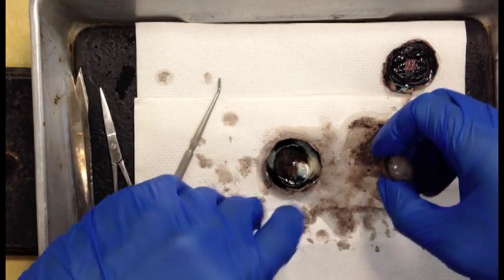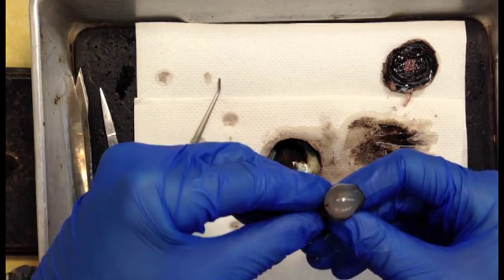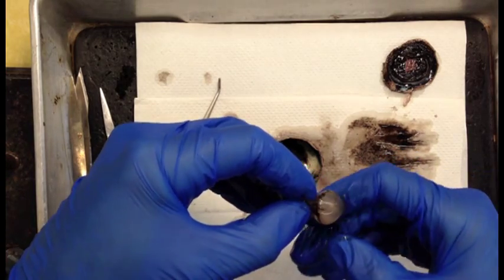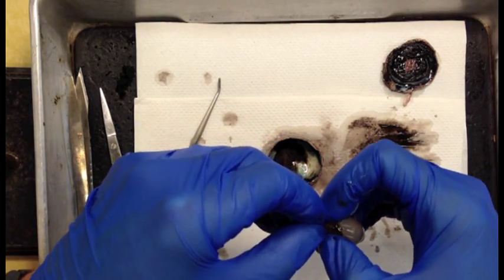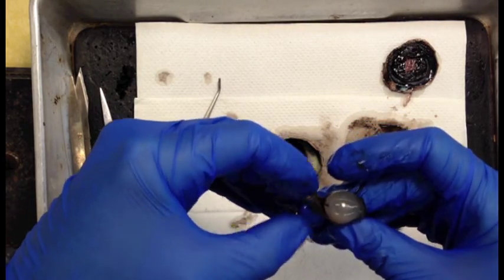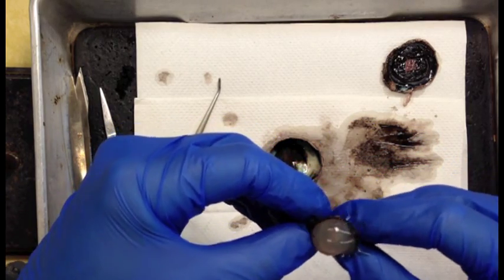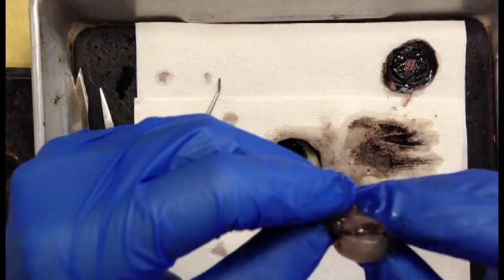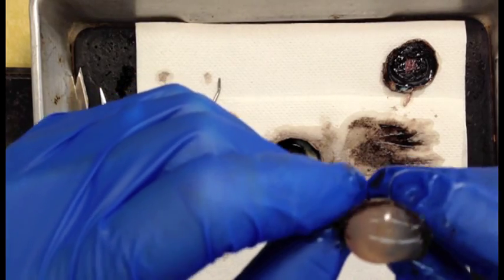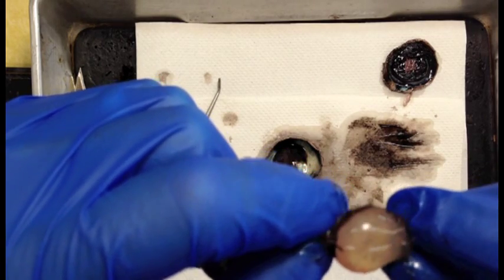Okay, now let's go ahead and take a look at the lens. So I'm going to very gently try to get some of this vitreous humor off the lens without destroying the lens itself because it's very delicate. And when you get the lens out, make sure you hold it up to the light and look through the lens to see if you can see an image through it.